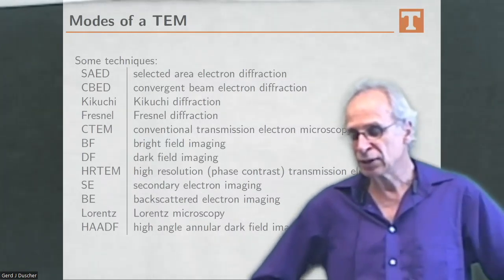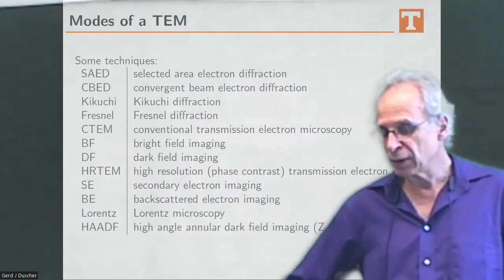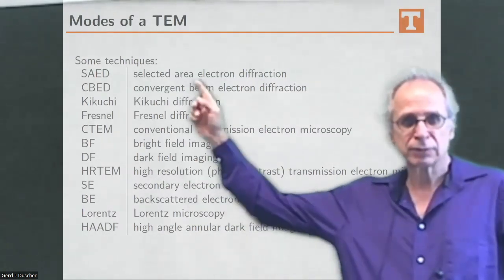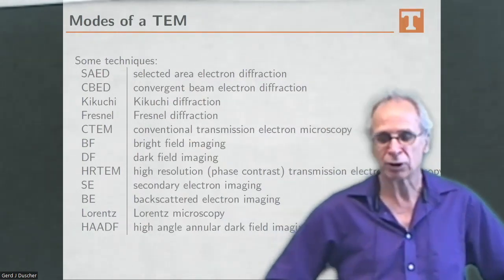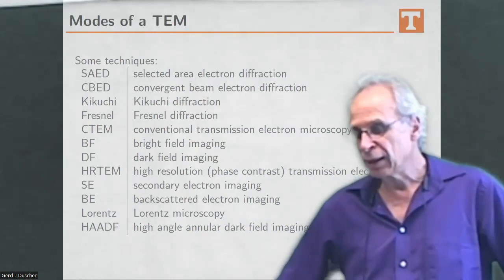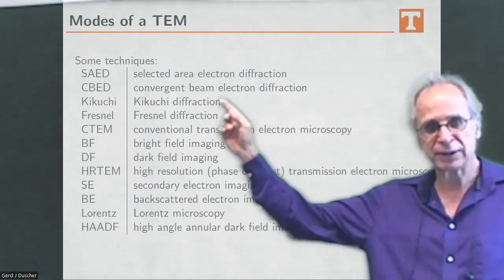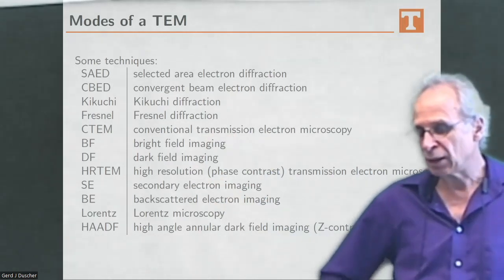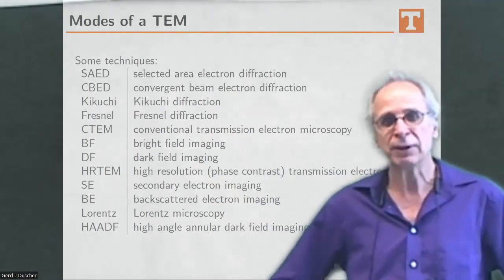Okay, so for the elastic part, we have quite a few different modes or techniques in the TEM. And many of them, basically all of them, are also used in scanning transmission electron microscopy.